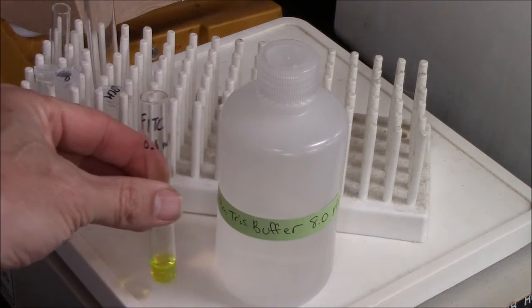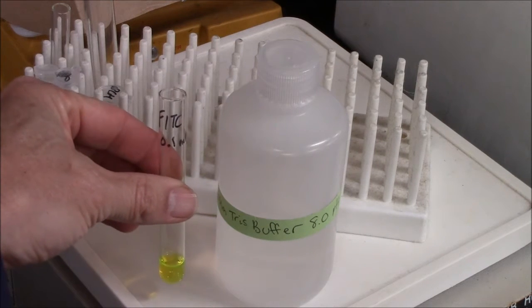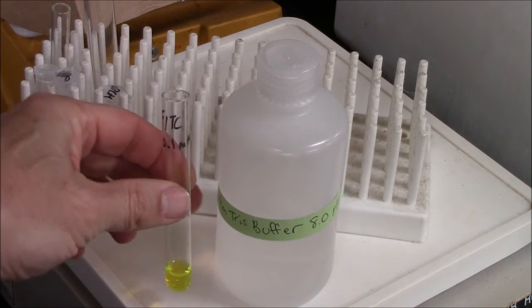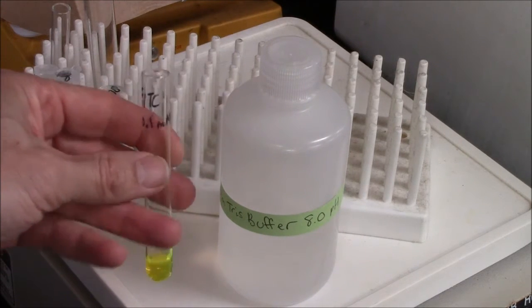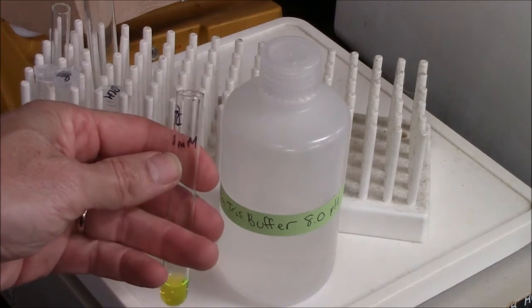I've made a solution of FITC, Fluorescein Isothiocyanate, in this tris buffer, 30 millimolar tris buffer, pH 8.0. Concentration of the FITC is 0.1 millimolar.